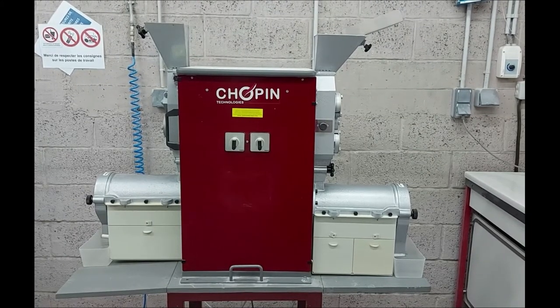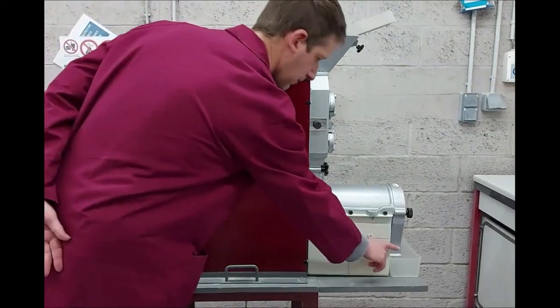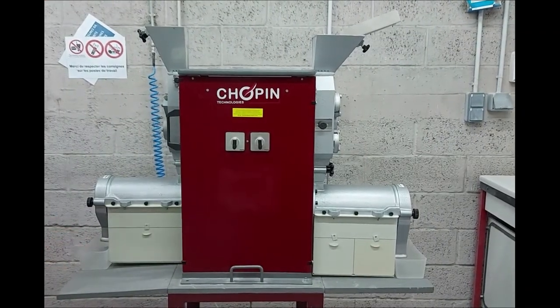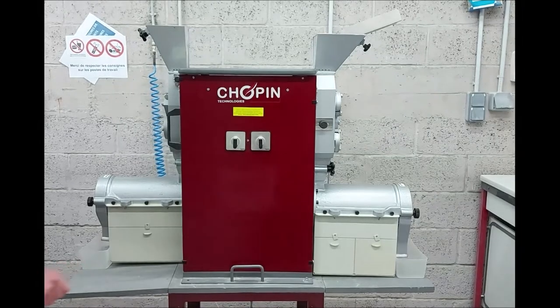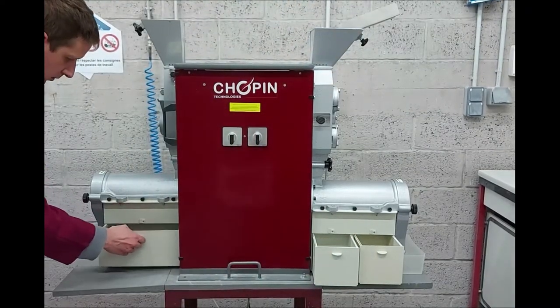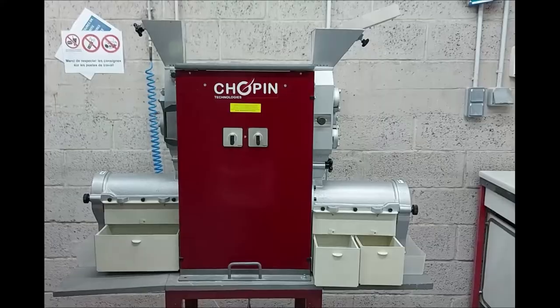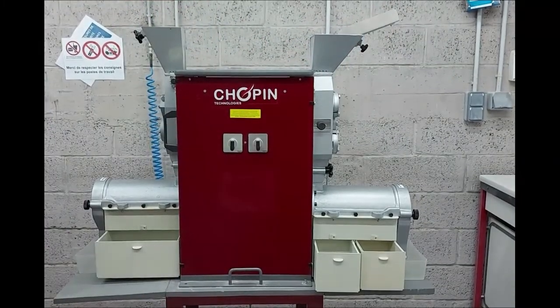Before starting the milling process, you must check that the two plastic bins intended to collect bran are correctly positioned at each end of the mill, that the bins intended to collect flour and middlings are empty, and that the magnetic feed chute is positioned on the breaking hopper.